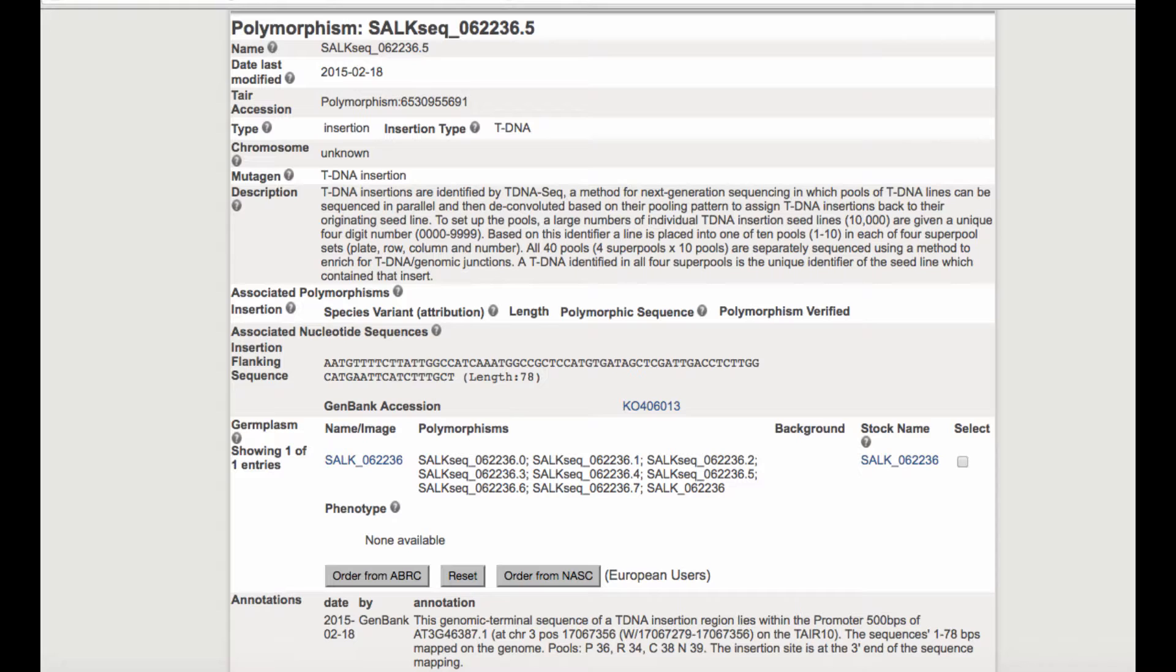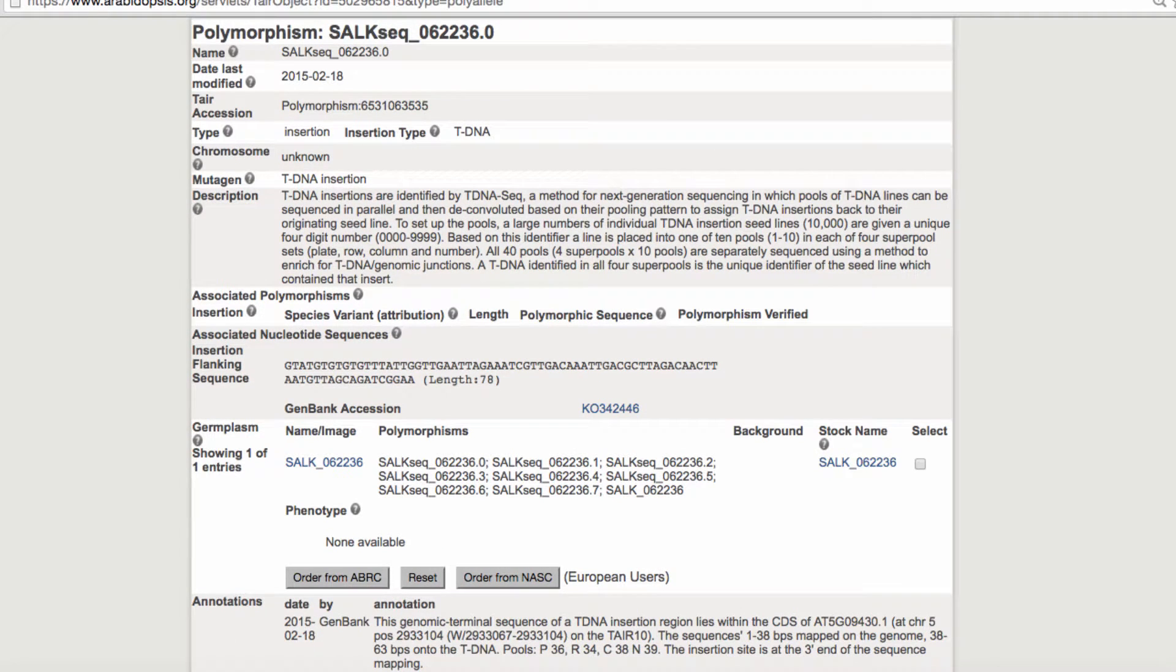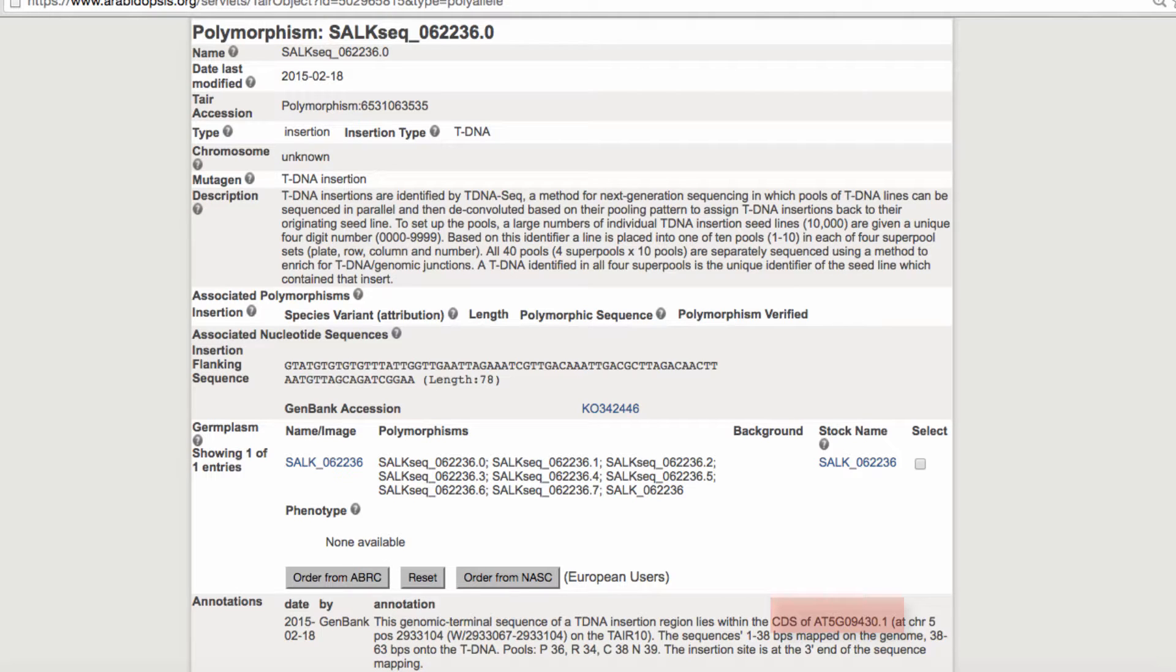For example, the tDNA-seq with a .5 allocation is inserted into a gene on chromosome 3, whereas the tDNA-seq .0 is in a gene on chromosome 5, so there are multiple inserts in multiple genes in the strain.